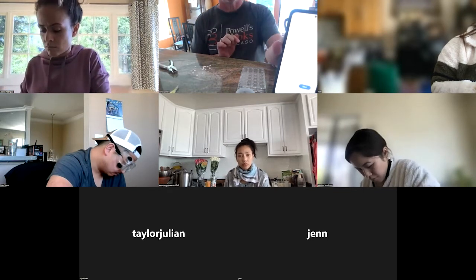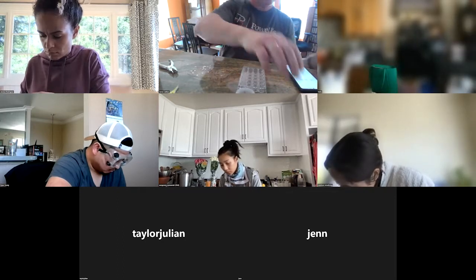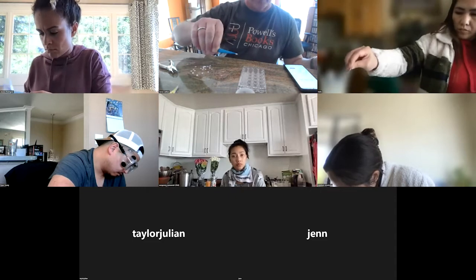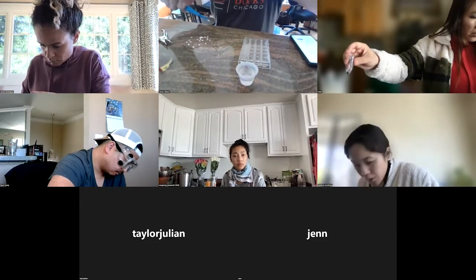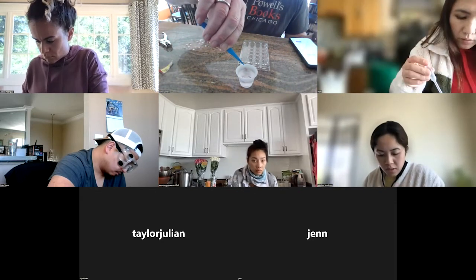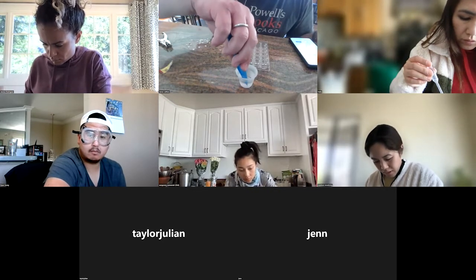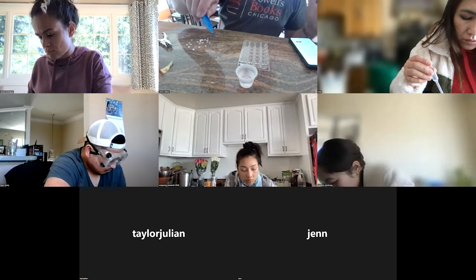All right, got my timer ready to go. Here's my disc, and I'm going to drop it in the solution, the 1.5% solution, and push it to the bottom. There, it's now on the bottom. Start my timer.